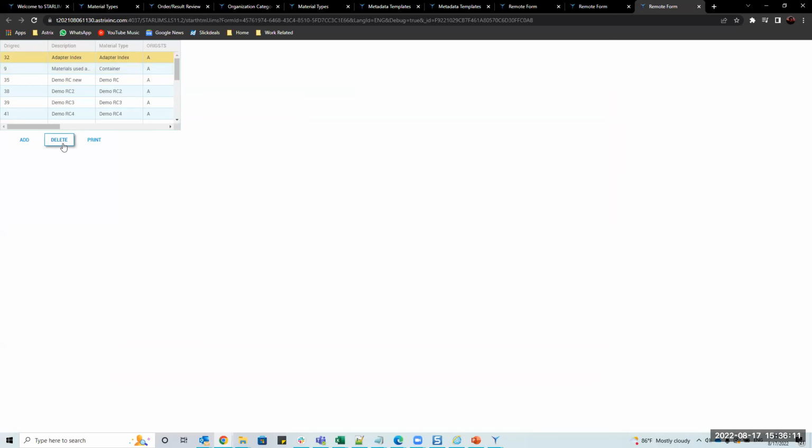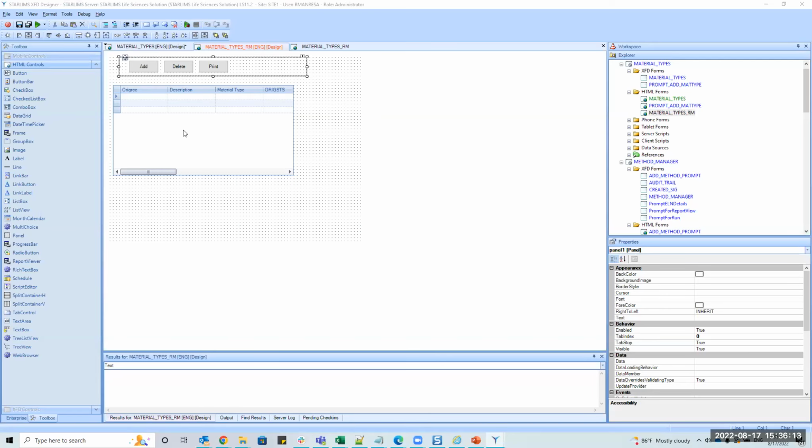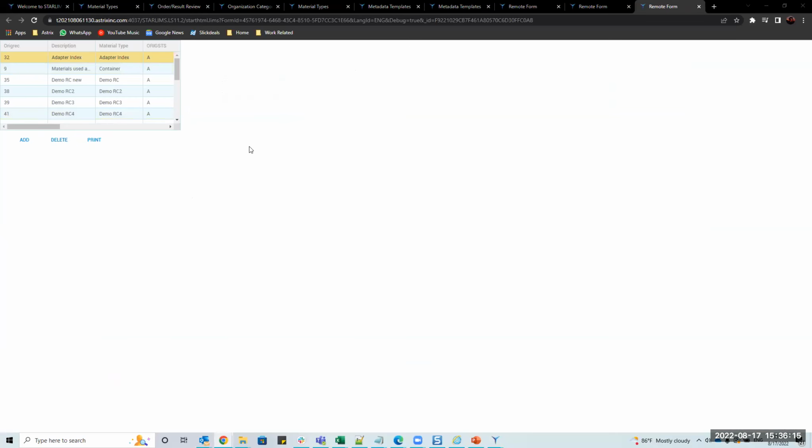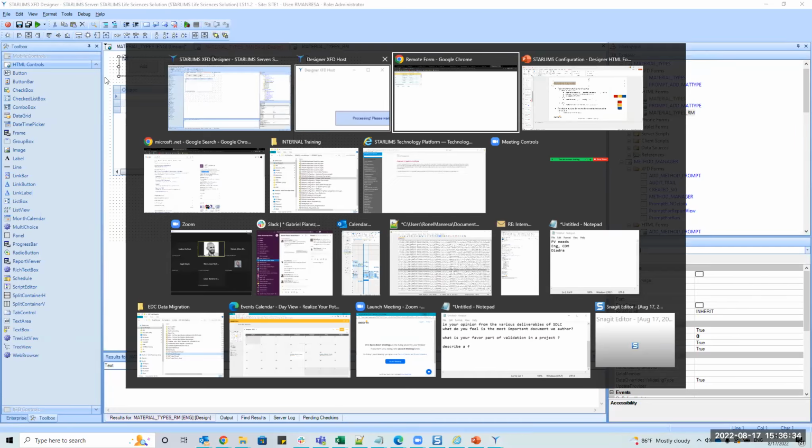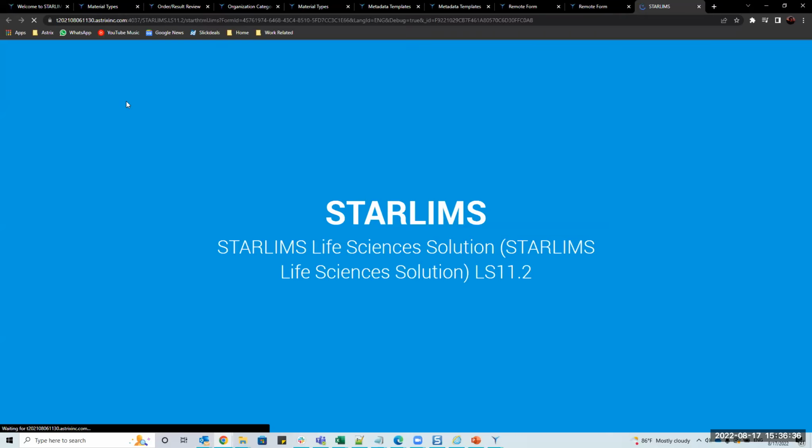Yeah, you see, so that's, I mean, I have it here. Why does it do this? It deals with the way the controls, the order that the controls get added to the form. So if you want to push this guy to the top, I always get this confused, either bring to front or send to back. I want to say, let me try bring to front, but I think it's the other one. Let me see. I think it's, yeah, send to back usually.